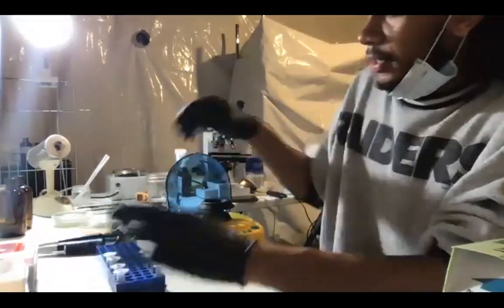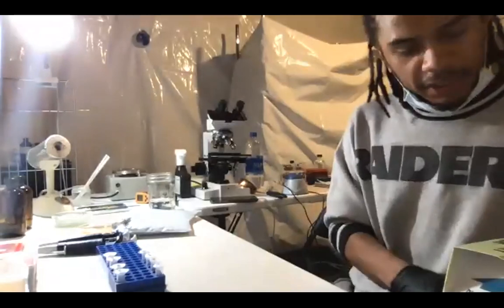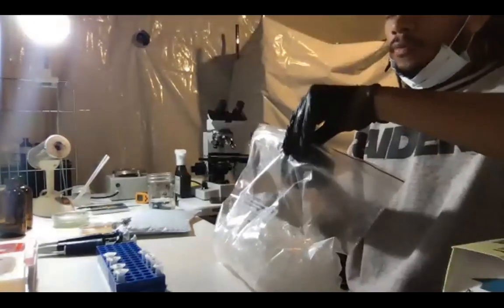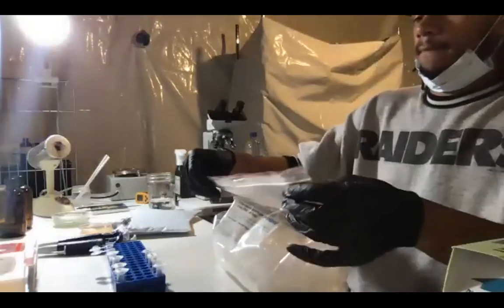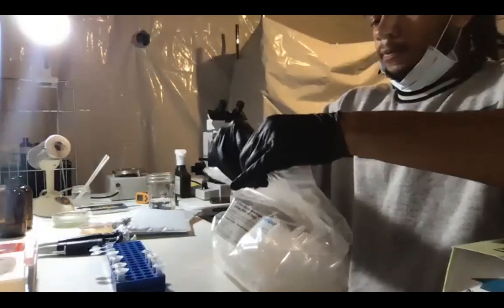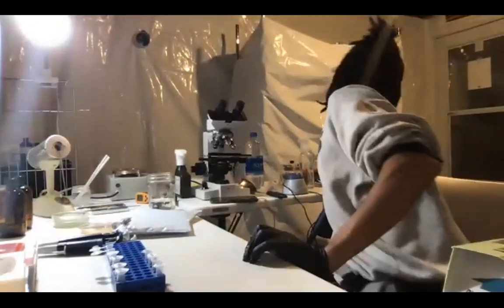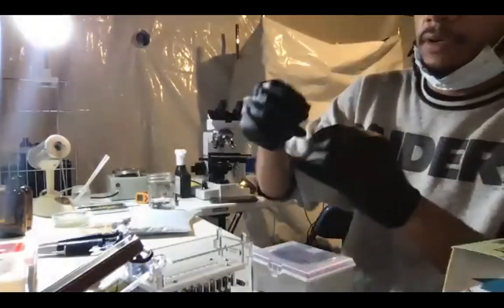One thing I like to do, because it's not too expensive, is that everything I'm using, except the master mix, is a little expensive, but I like to make double the amount that I need. So I'll need two more centrifuge tubes to make the mixes: one tube for MAT1, one tube for MAT2. And I don't buy racks for my PCR tubes. You don't really need it. You can just put your PCR tubes directly in your PCR machine when you're about to run it.